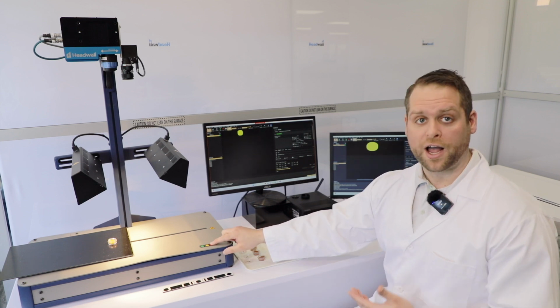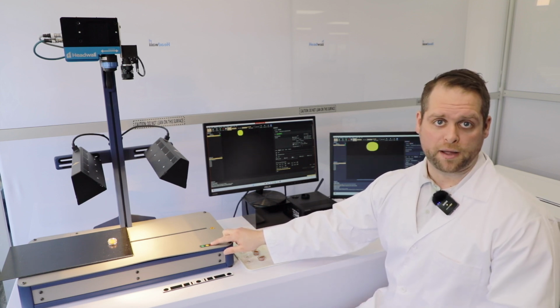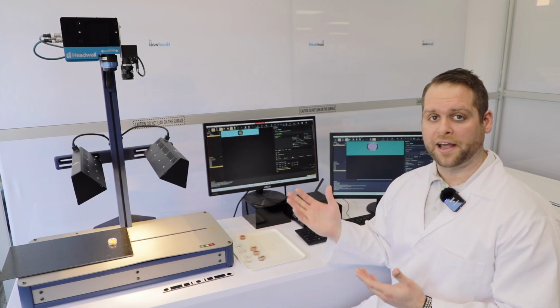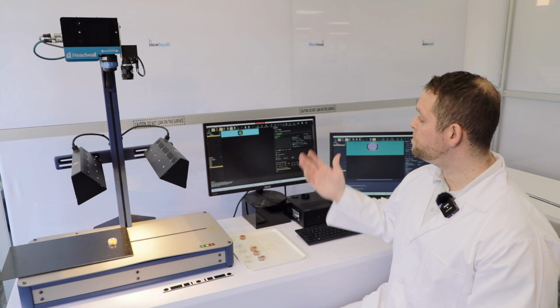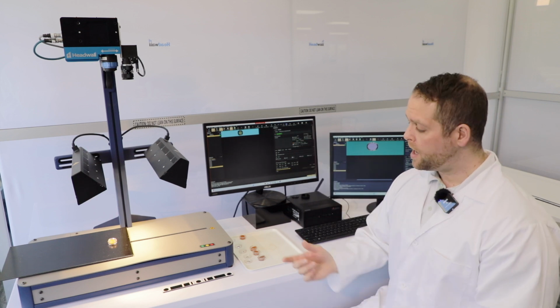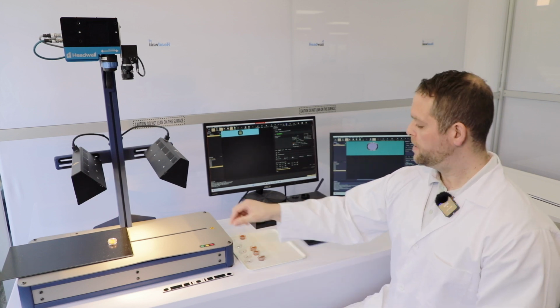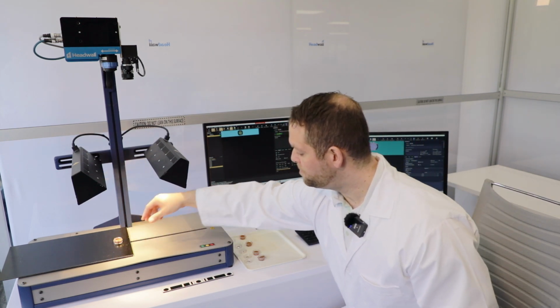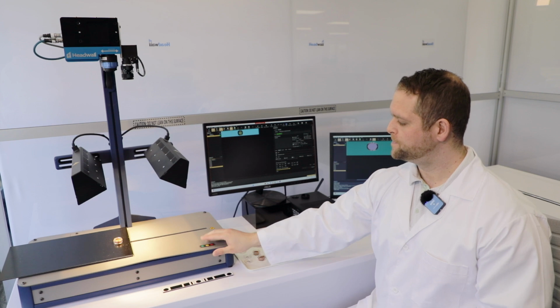When I've done so, I've programmed the last button, the red button, to save from memory to disk. And now I can see that I've got a data cube of that powdered sample. I can also increment the sample names so I can move on to my next sample and repeat the process.